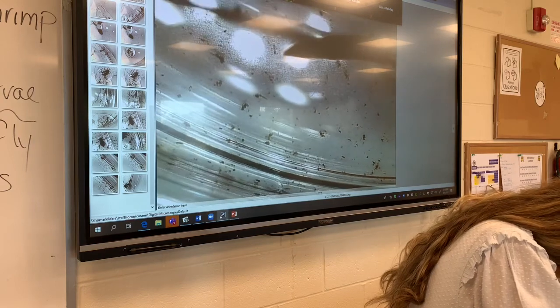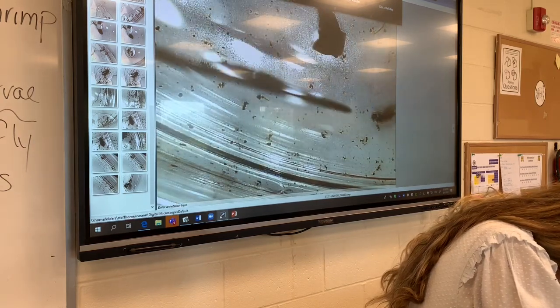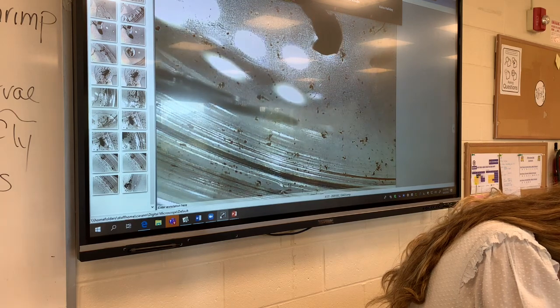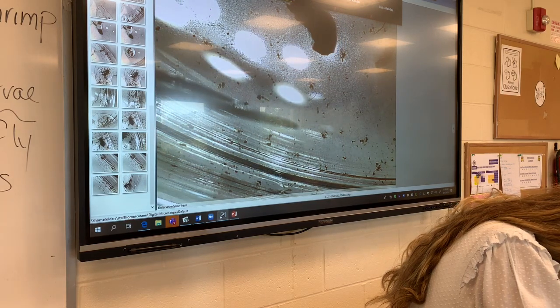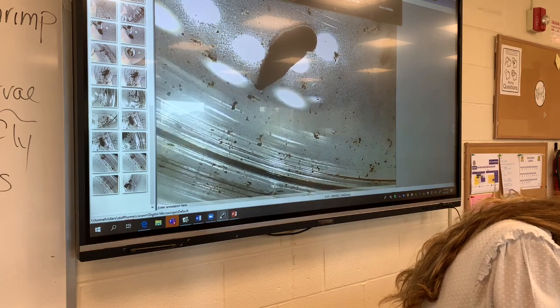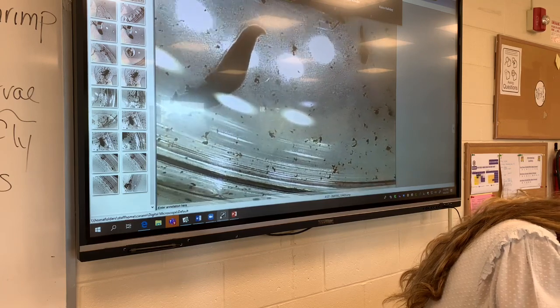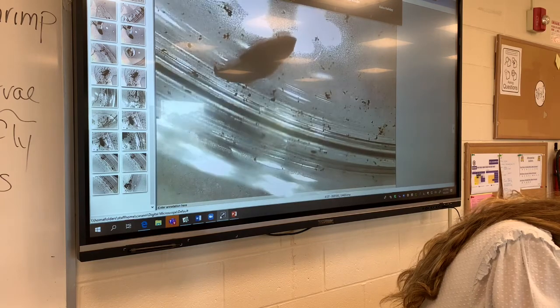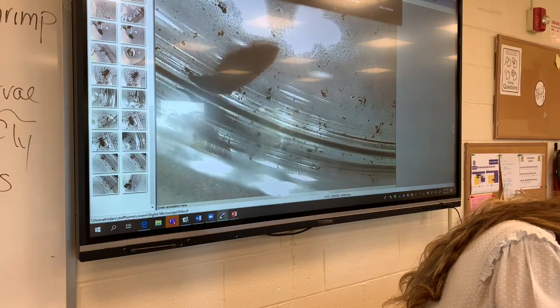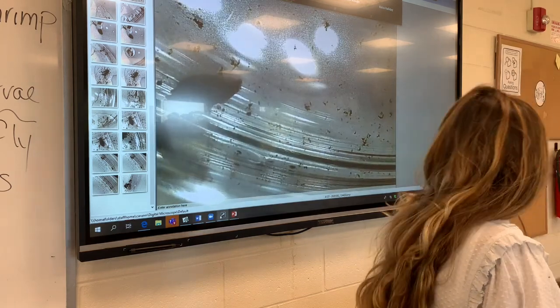No, I did that in the other class. Oh man, what did I do? I tried to split it like the letter Y. It looks like I cut a fraction of its head off — I'm not so sure if a tiny piece is going to regenerate. It's moving independently. Do you see that little piece?